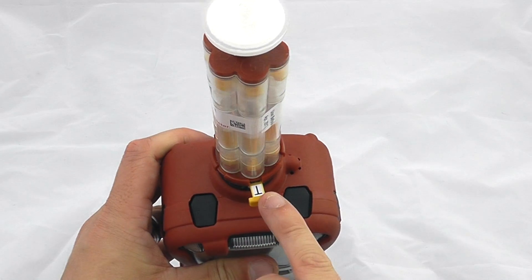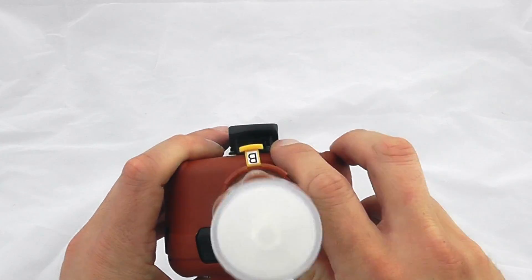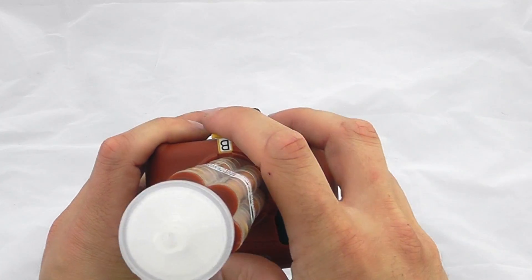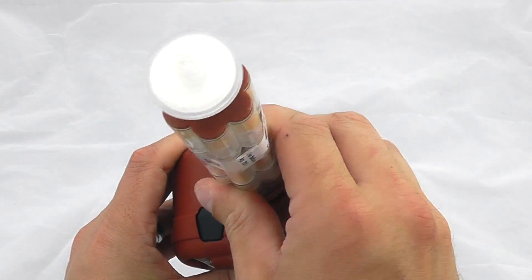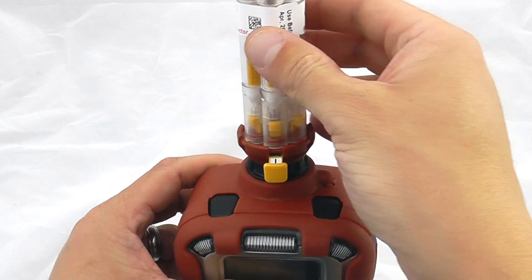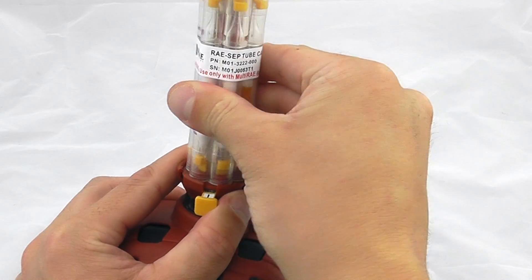At the moment we can see we're in total VOC measurement mode, and you can also flick it into benzene measurement mode, which we'll look at in a bit more detail. For now we want to keep it in total VOC measurement mode. You can see there's a hydrophobic filter at the top and a multi-point tube operation.